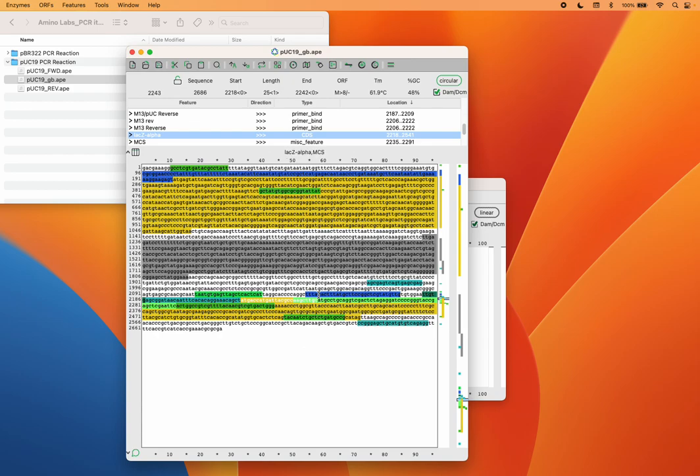If I go one more here up, we've got 61.9 and 48. So I would say while the GC is closer, the TM is a little bit high. We're at 62 now almost. So let's dial that back to this 59.6. So this is a very good sequence.